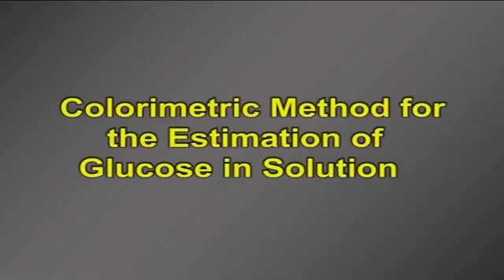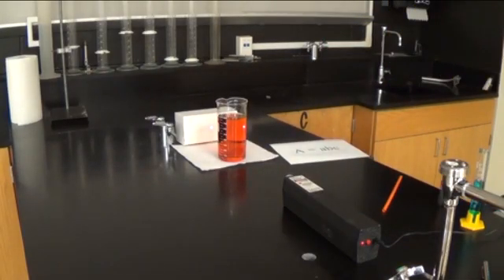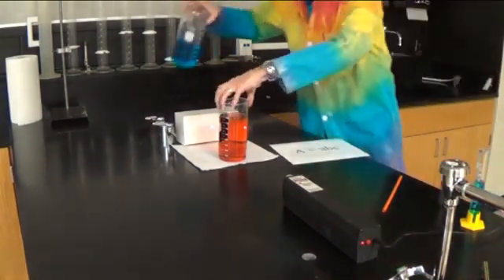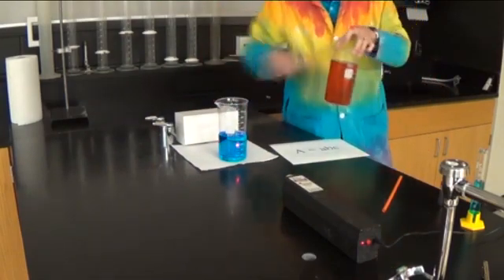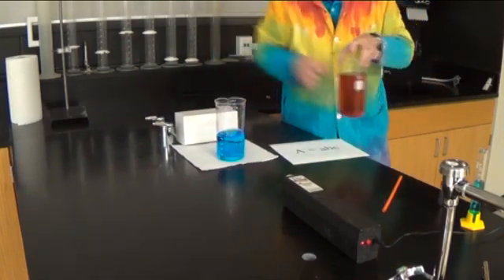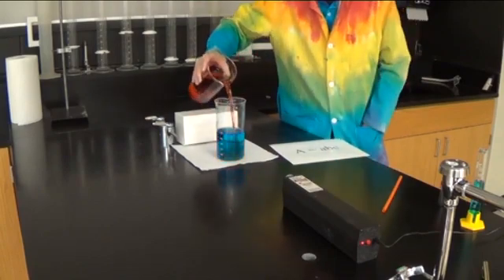Colorimetric method for the estimation of glucose in solution. One useful and often used way of obtaining the concentration of chemicals in a solution, if it has a color, is by the colorimetric method. If the analyte is not colored, an appropriate reagent must be added that reacts with the analyte to produce a colored compound.